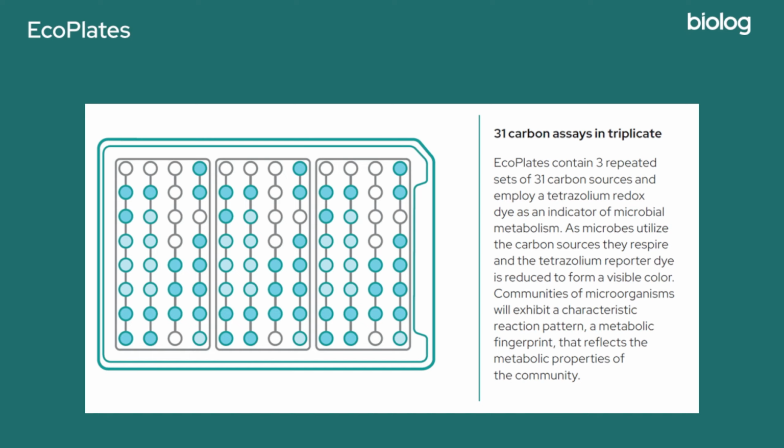When comparing communities and their metabolic flexibility, it's important to take a look at a variety of factors like overall energy output, diversity of substrates utilized, and how effectively substrates are used relative to one another. With Odin Community Analysis, we use 3 different metrics to make this easy.